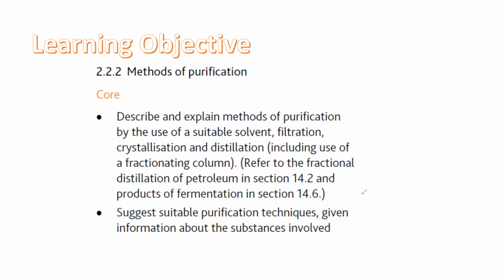Now, in this section, we will study the methods of purification. Methods of purification means how you can separate substances from a mixture. So different techniques can be used, and we will discuss each technique. So what are the learning objectives? You should be able to describe and explain methods of purification by using a suitable solvent, filtration, crystallization, and distillation.